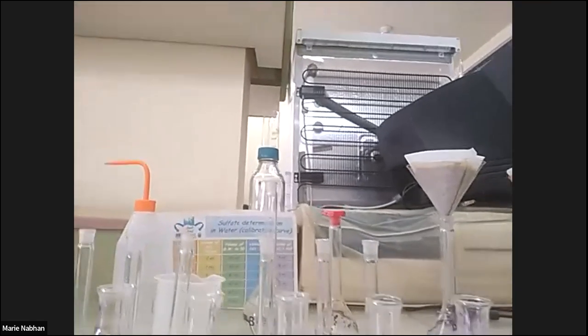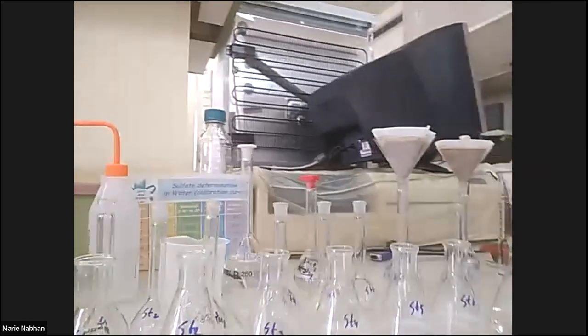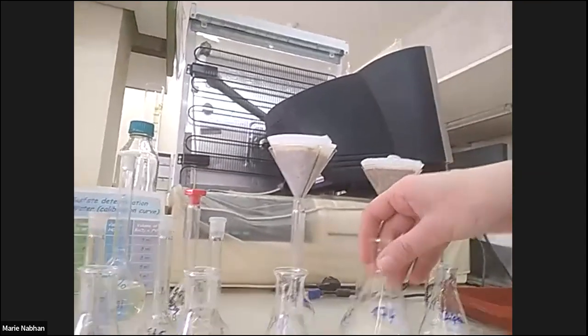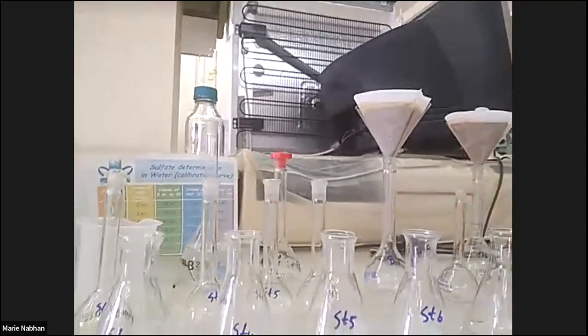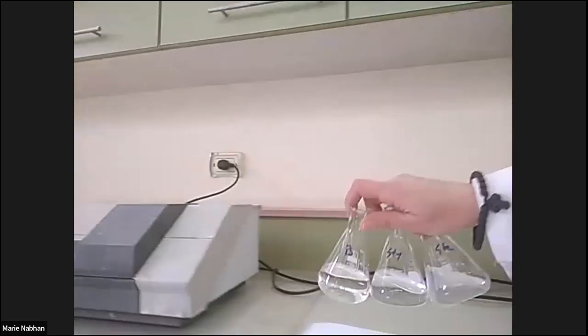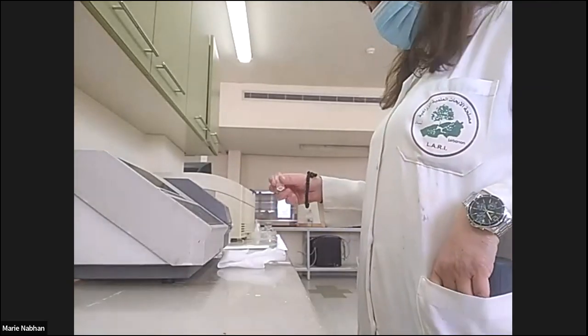We don't have to wait, so we can go on to the spectrophotometer directly. But it is still clear, so I think there is no sulfate. Normally in Lebanese soils, what is the sulfate percent? I don't have an idea.